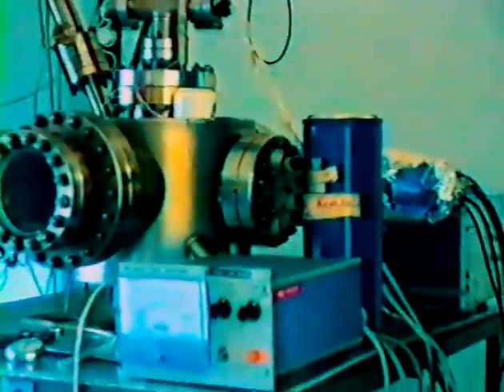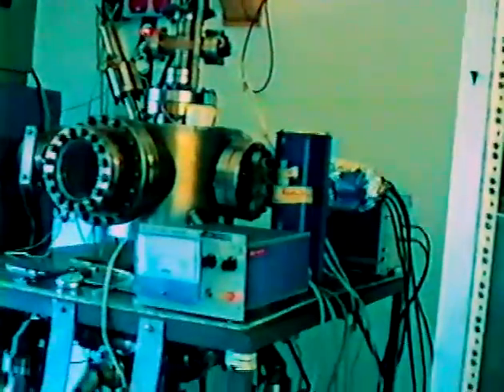There is a mass spectrometer for TDS, TPD measurements, and it is all a computer controlled system, and we can get our results through computing the raw experimental results coming from the facilities. But I see the shape of this UHV chamber is the same everywhere in the world.